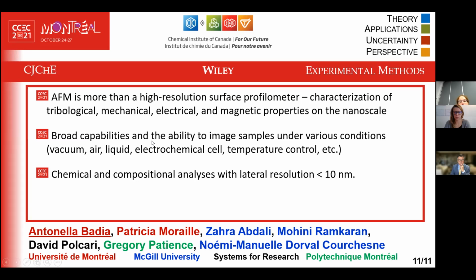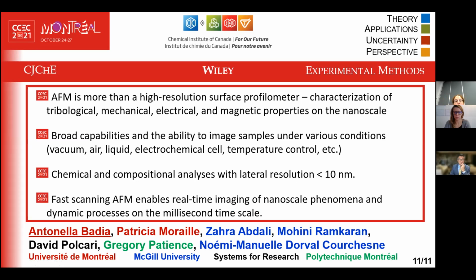AFM IR enables the chemical and compositional analyses with lateral resolution of less than 10 nanometers, and fast scanning AFM finally enables the real-time imaging of nanoscale phenomena and dynamic processes on the millisecond timescale.